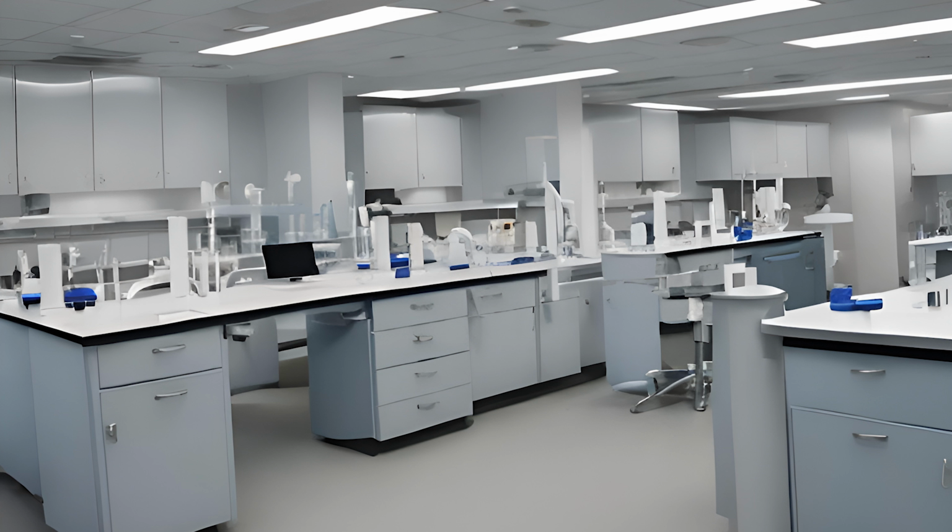The responsibility for the safety program begins with the facility and laboratory leadership. All new employees will be given a copy of the General Lab Safety Manual as part of new employee orientation. And it should highlight and bring attention to things like the proper labeling of the chemicals you work with, what type of fire extinguisher you have and where they're located, and how to use them properly. Different types of fire extinguishers are used differently. The safety hoods that you have, where they're at, how to use them, and how to make sure that they're in good working order.